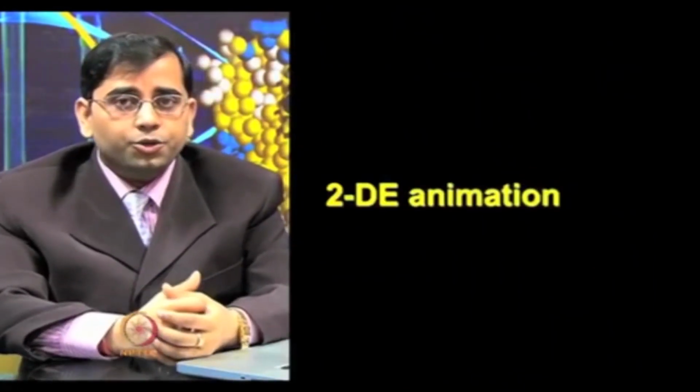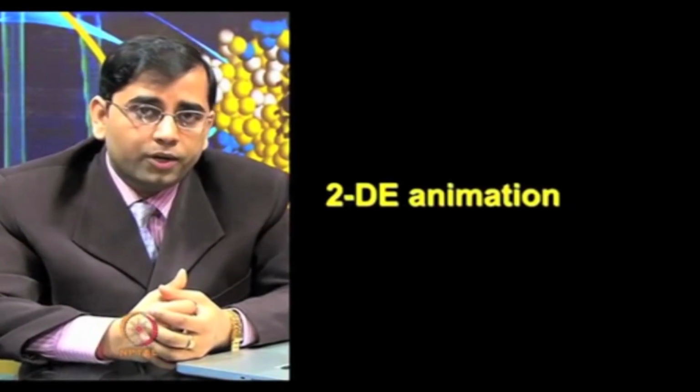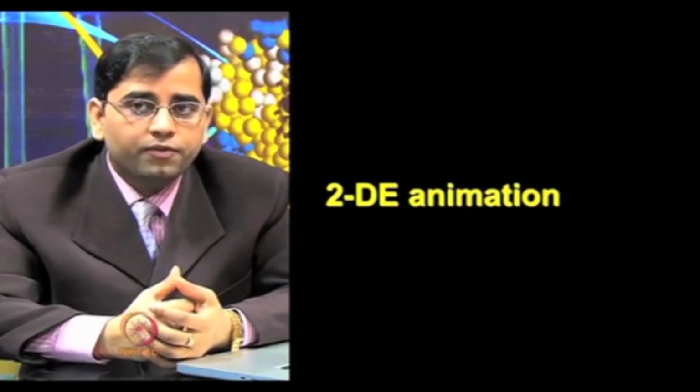So, I will now show you an animation for two-dimensional electrophoresis, which will give you an overview of different steps involved in the 2D experiment. So, in this animation, I will describe to you the two-dimensional electrophoresis process. Prior to isoelectric focusing in two-dimensional electrophoresis, the commercially available IPG strips must be rehydrated. This process can be done either by passive rehydration or active rehydration.